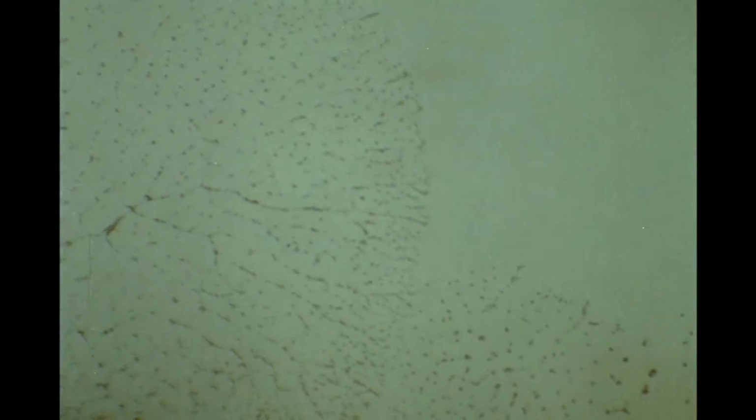Labyrinthula demonstrates a primitive colonial organization characterized by gliding movement of the individual cells within a continuous filamentous network. This low magnification scene scans an expanding colony in which the action has been speeded up 2,000 times.